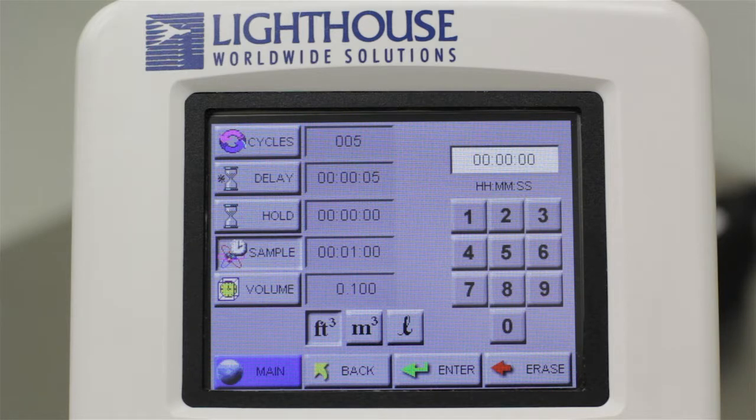The instrument allows you to set up an automated sample. This gives you the option to have an initial startup delay, to run multiple samples with a fixed hold time between samples, and to set your sample size based on time or volume, depending on your needs.